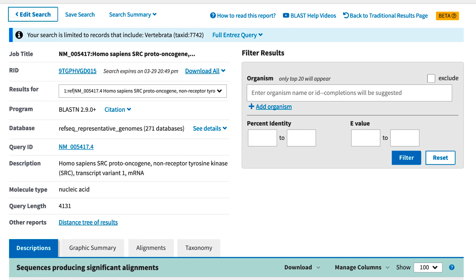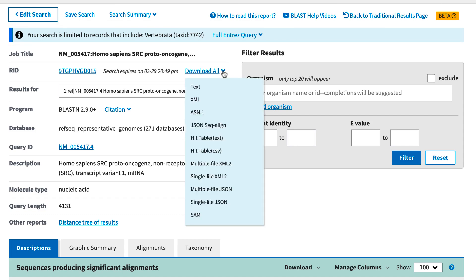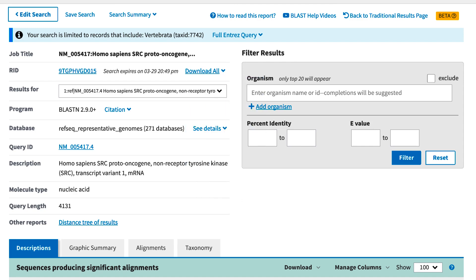Let's review what we are proposing for the new results page. First, be aware that the content of the results has not changed. For example, the Download All feature, which can be very handy when you input multiple queries, produces the same data in both the traditional and beta results, and the same is true of the other parts of the report: descriptions, alignments, etc.